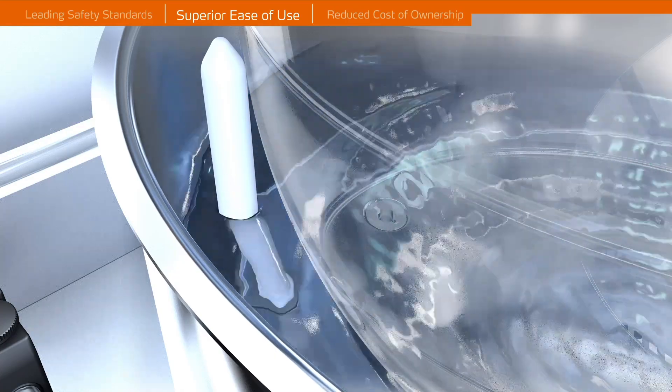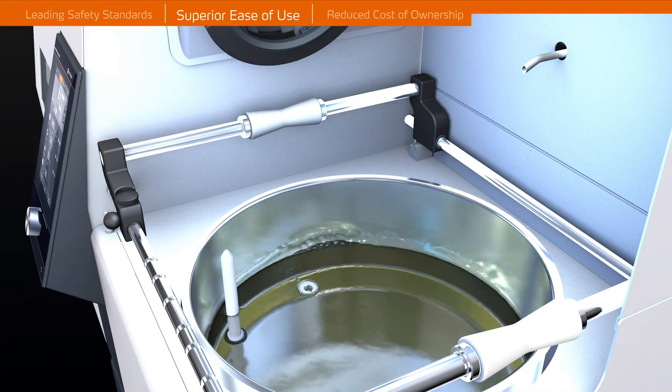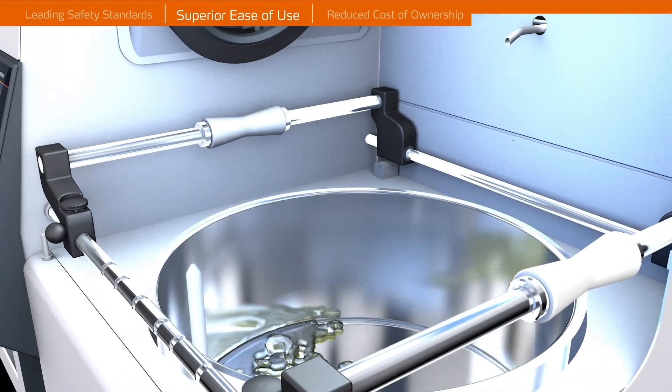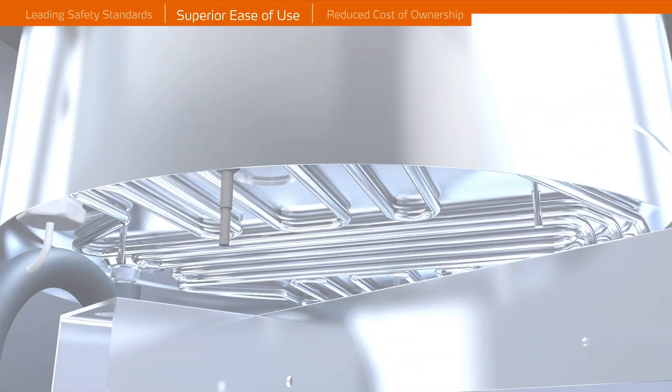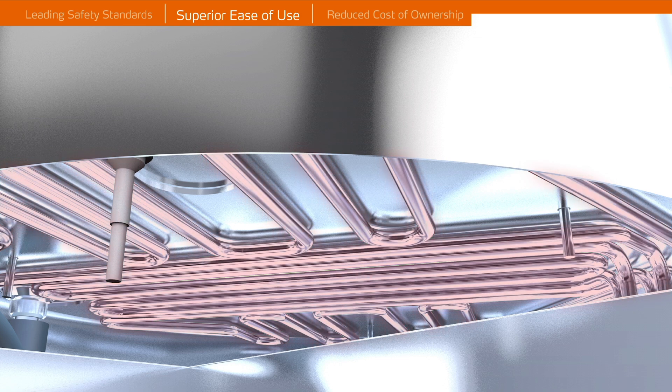The universal heating bath is built for water and oil and has a drain valve allowing for easily changing the liquid. Integrated heating coils allow for easy and fast cleaning of the heating bath.